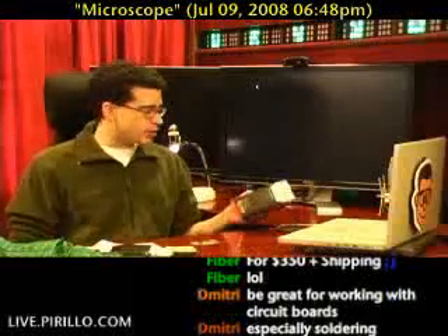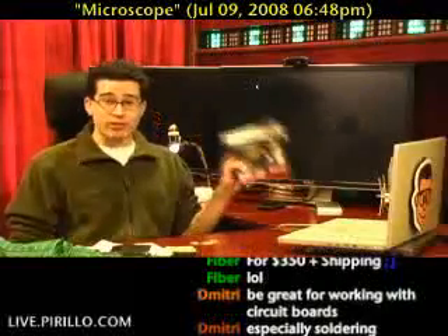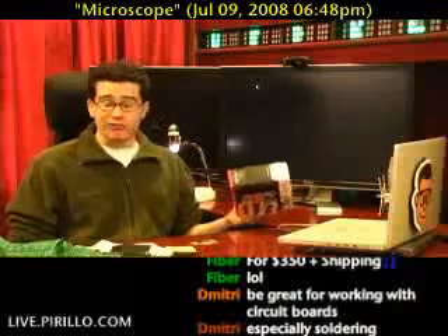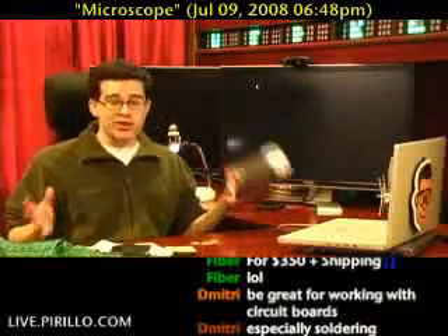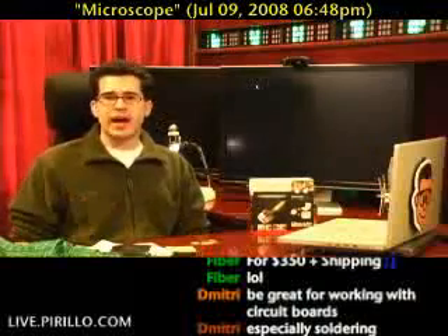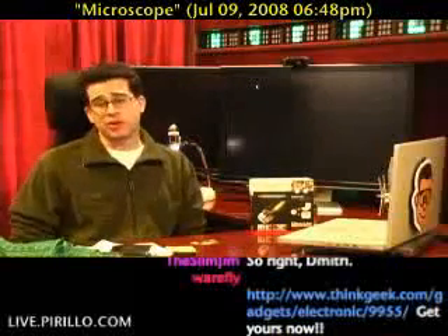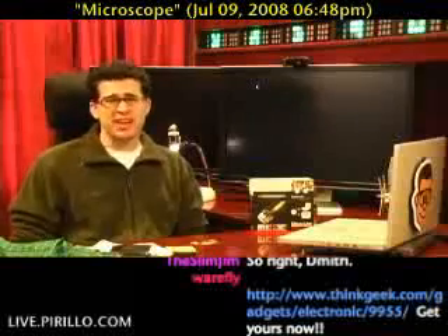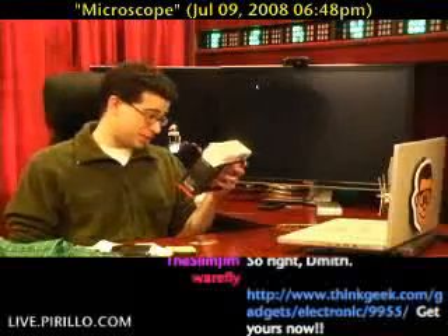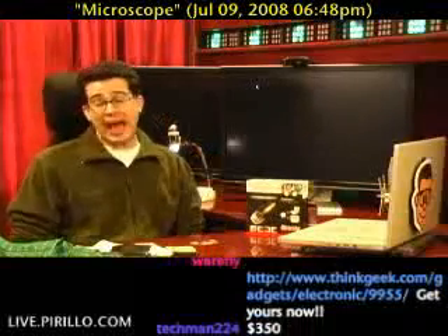When they gave me the opportunity to take a look at the DinoLite digital microscope — this is a 1.3 megapixel USB microscope — I said yeah, I'm all for it. I love USB gadgets and I love digital microscopes. The ProScope that I had purchased a few years ago kind of broke and it wasn't worth replacing. This microscope is 1.3 megapixels times better than that other one, and the software actually does work.